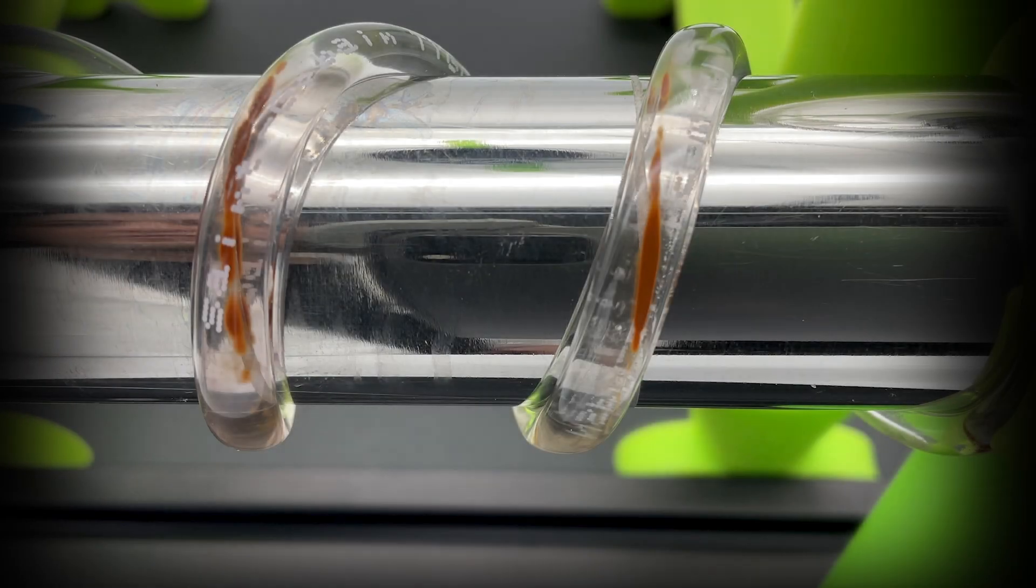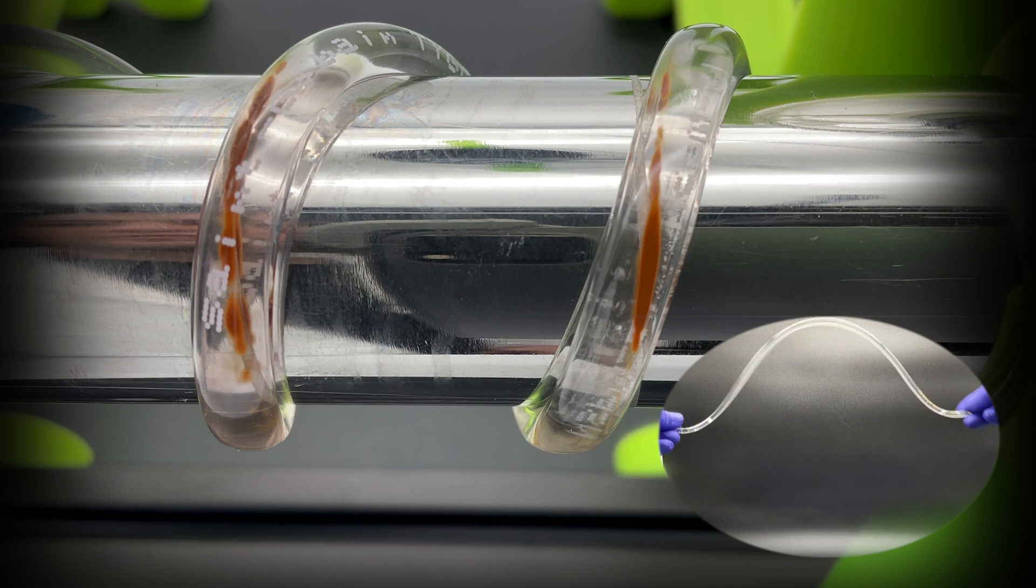This is a close-up of the trapped resin in the high intensity magnetic field zones. I typically twirl the tubing for a few seconds to re-suspend the resin within the tubing before purging the tubing in the next step.